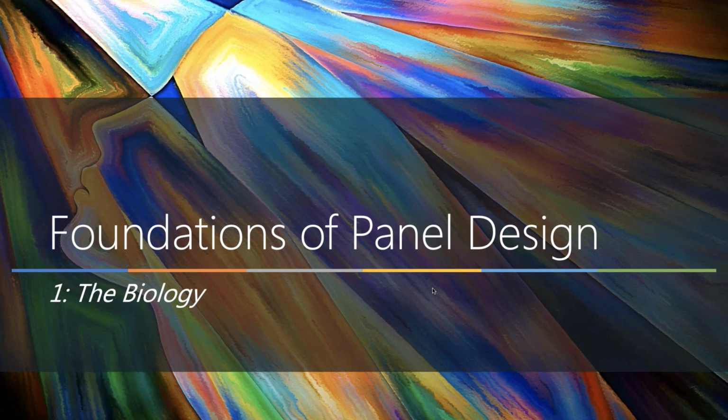So now that you have a big overview and understanding of how we use the technology and why we are so excited about it and why we can do things differently than what has been done until now in flow cytometry, let's go to what is very important in your lab when you have access to this technology, and that is to do a very thorough panel design.